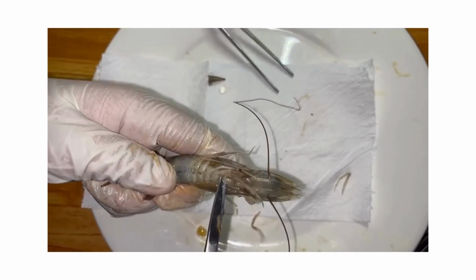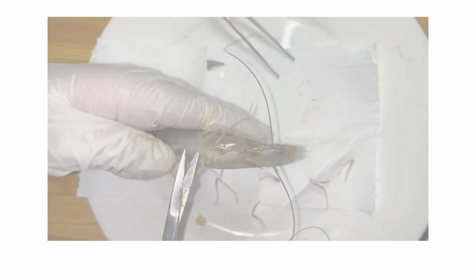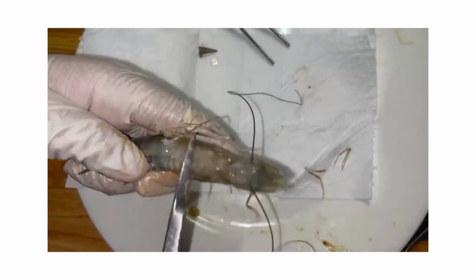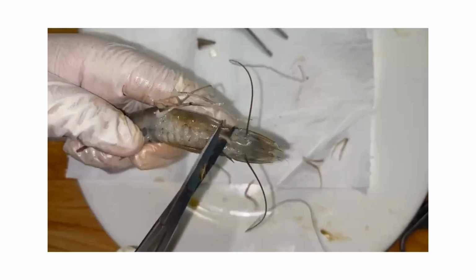Next is to dissect the maxillipeds. To dissect them, the shrimp is placed ventral side up, and fine dissection scissors or forceps are used to gently detach each maxilliped at its base. Care must be taken to avoid damaging surrounding structures such as the mouthparts or antenna.